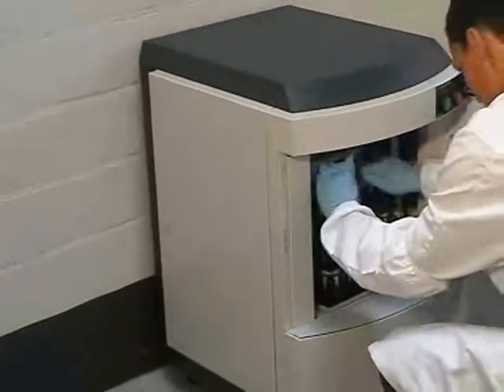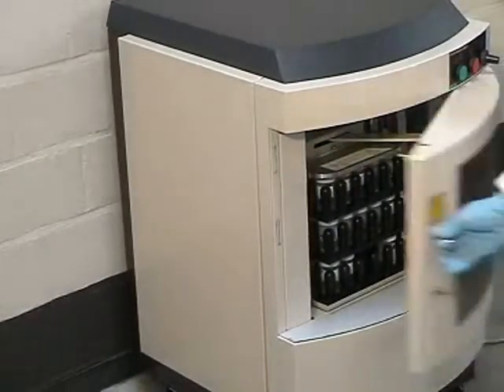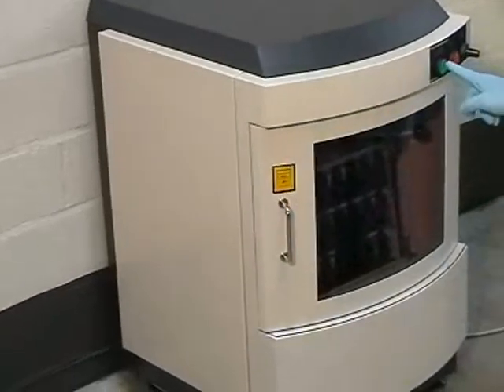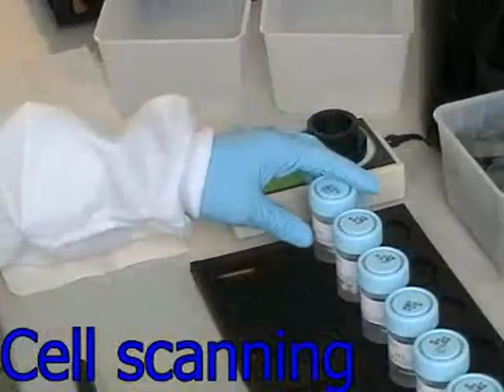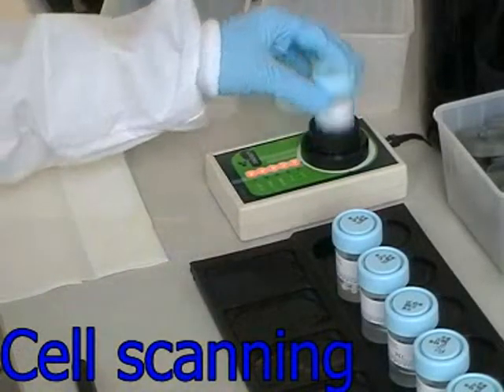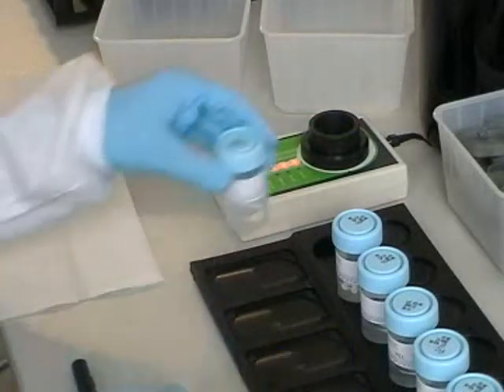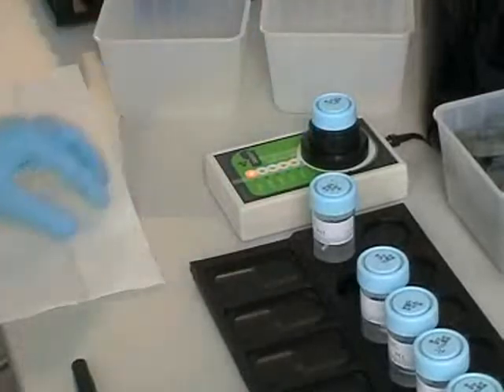The Cytoshaker can shake 75 vials in less than 2 minutes. Once the vials are ready, the Turbitec cell scanner will give you the correct cell concentration. Write down the correct volume code on the cap for each vial.